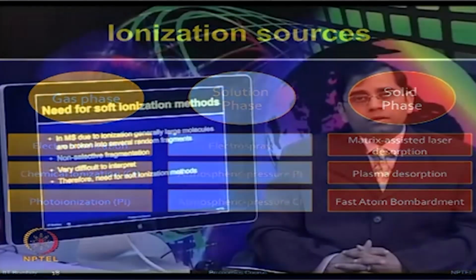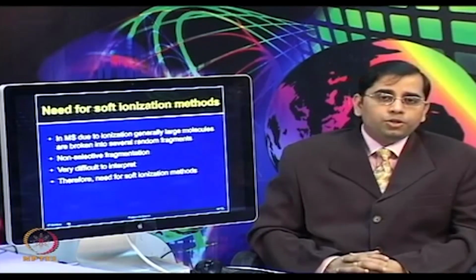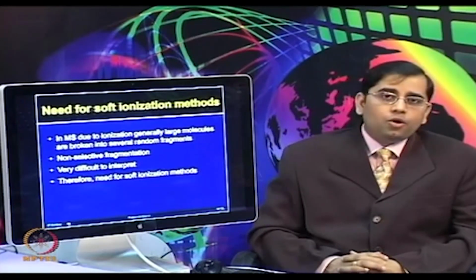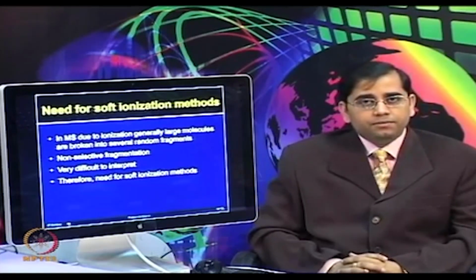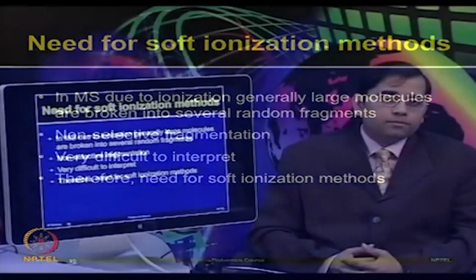The traditional ionization sources used for small molecule chemical applications relied on chemical or electron ionization, but these processes are too energy rich to ionize intact large biomolecules, and they lead to unpredictable analyte decomposition.